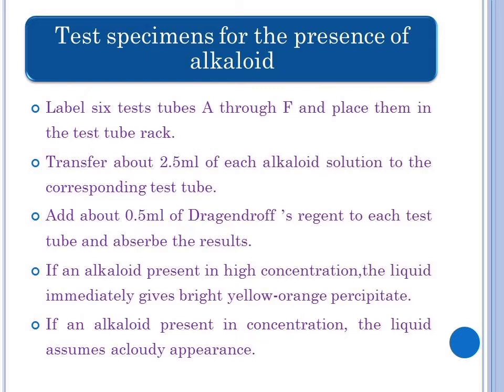When you have spotted all of the strips with your own alkaloid solutions, repeat the spotting for all the strips. Try to place each new spot directly on top of the dried spot. The goal is to get the smallest and most centralized spot possible on each strip. Re-spot each strip until you have spotted it at least 5 times, and then allow the strips to dry completely.